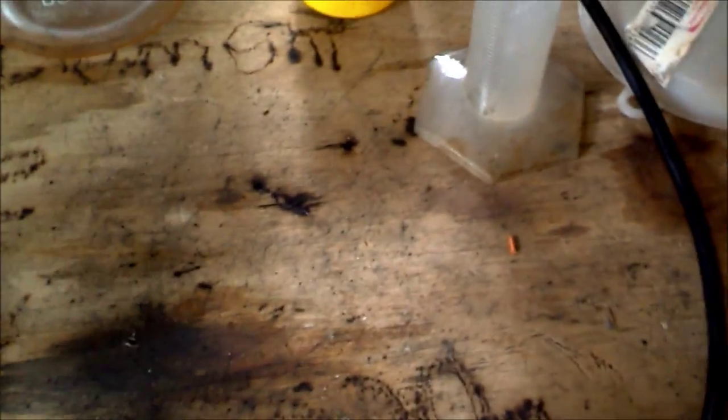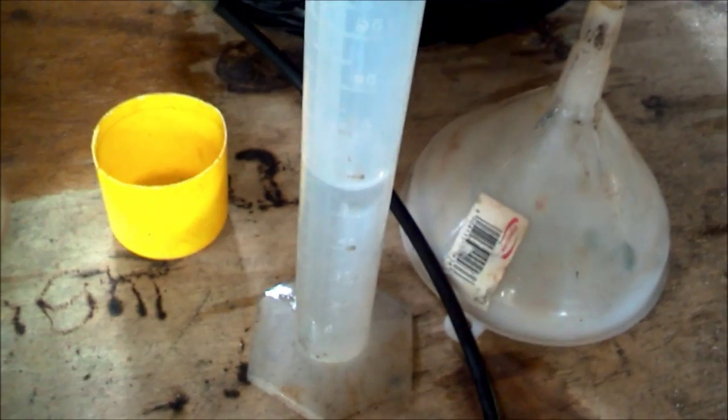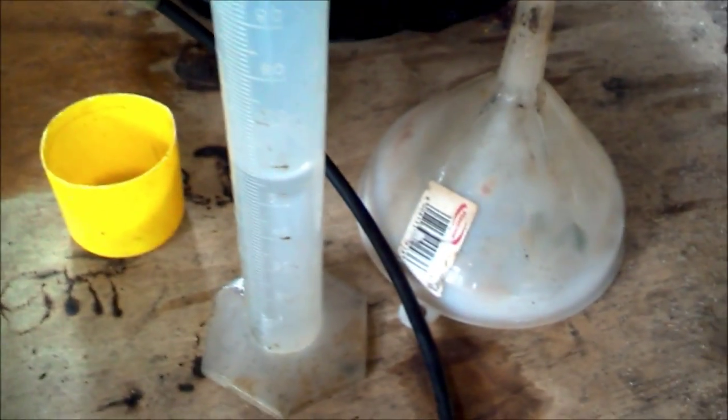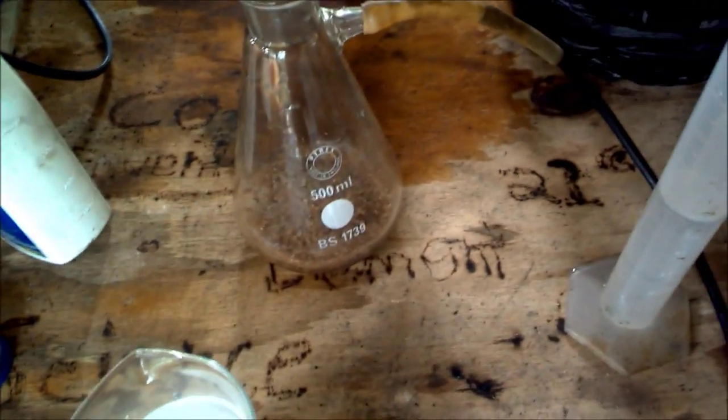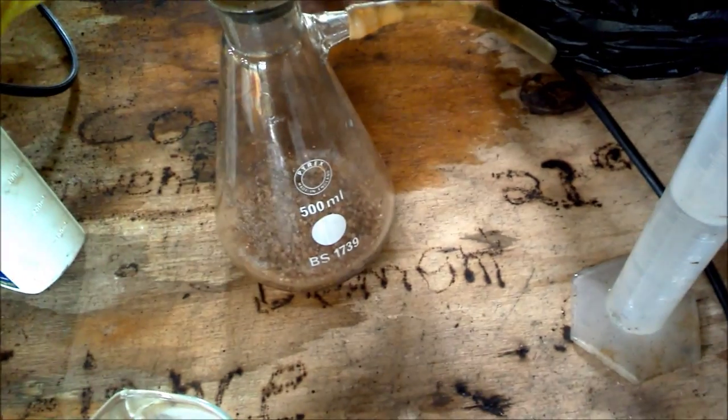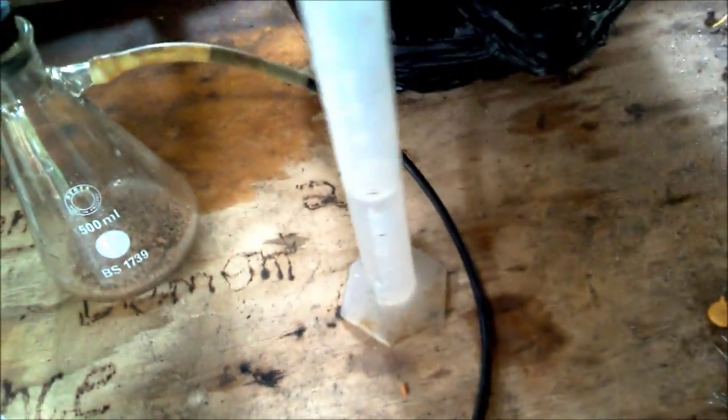Once you've got the solution ready, take some ammonium sulfate and put it into the flask. Place the lid back on the separatory funnel for now. Now make sure it's cool.